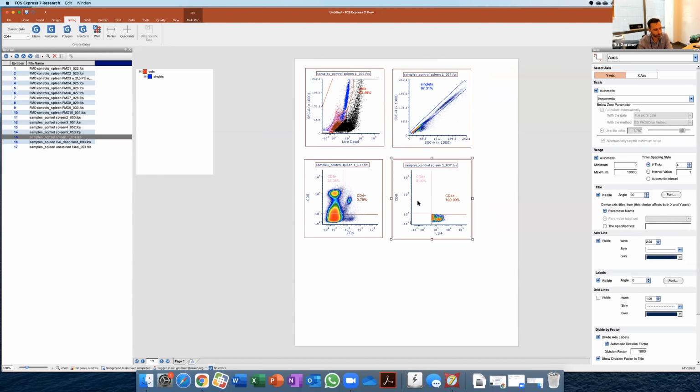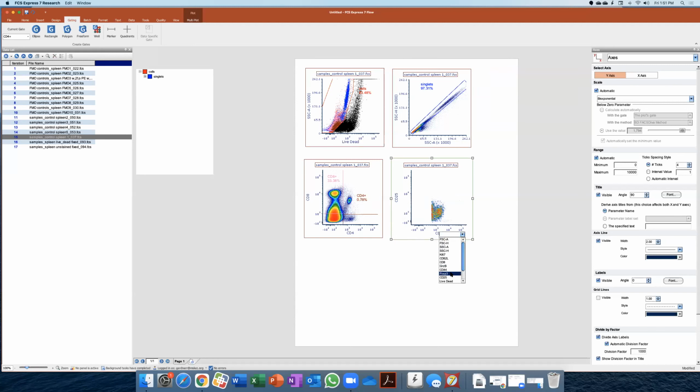And that's even other things like making sure that you use an Fc block before you carry out your staining, or if you're using a secondary alone, which I don't suggest in general anyway, making sure you spin that secondary down and just use the supernatant so that you're not getting any really sticky secondary that's non-specifically binding. So all things like that to optimize will help you be certain whether it is low-level staining that you can gate on and be certain about, or just some background that you're seeing. Right.